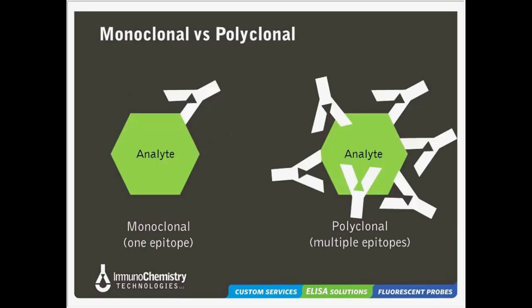But it is the key discriminator, if you want to call it that, for how we make these immunoassays work. You have to have something that is very specific. You have to have something that grabs hold of something and hangs on to it so that you can come in and measure it. And if you didn't have a specific or high affinity antibody, you couldn't do any of these assays. It doesn't matter what type you're looking at.